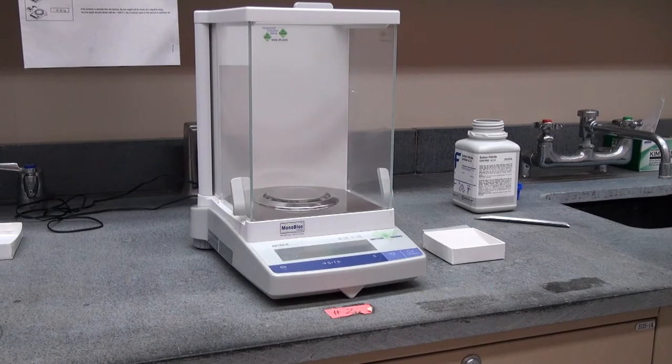How to use an analytical balance. An analytical balance differs from a top loading balance primarily in that it can measure masses to greater accuracy. This particular balance can measure a mass to four decimal places.